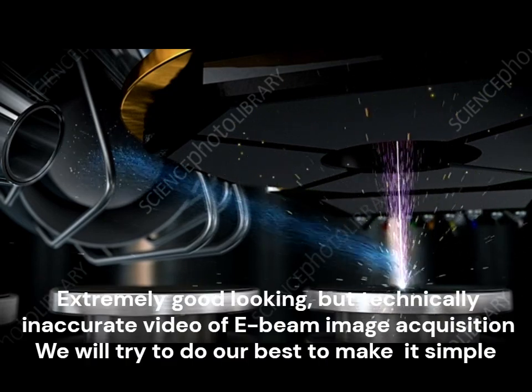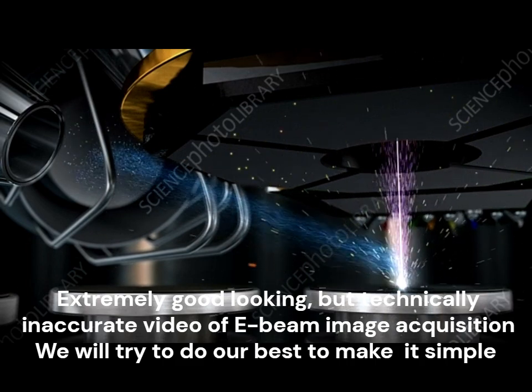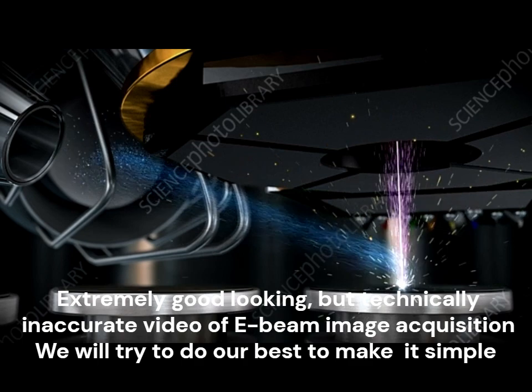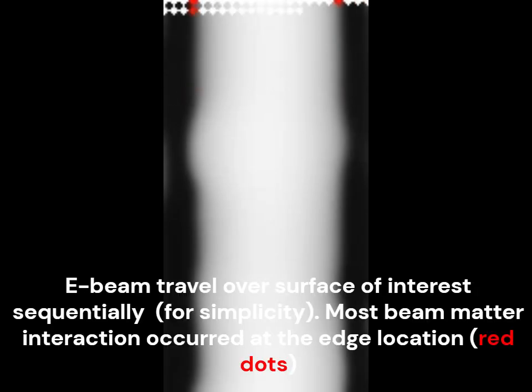Extremely good looking, but technically inaccurate video of E-beam image acquisition. We will try to do our best to make it simple, not digging around with too much explanation about detection, beam resolution, and using most simplified approximation of E-beam scanning. E-beam travels over the surface of interest sequentially for simplicity.